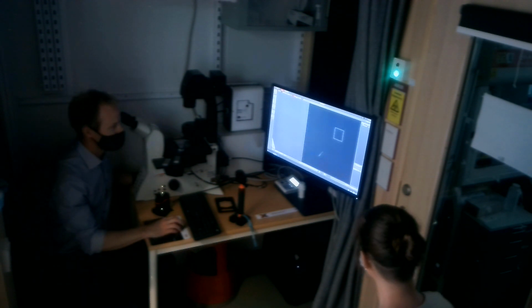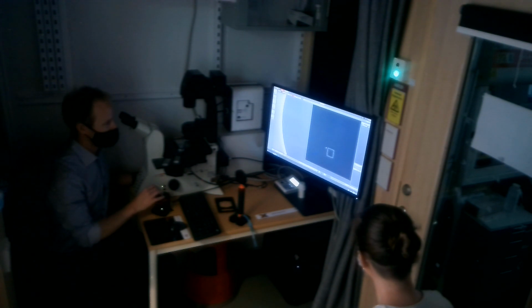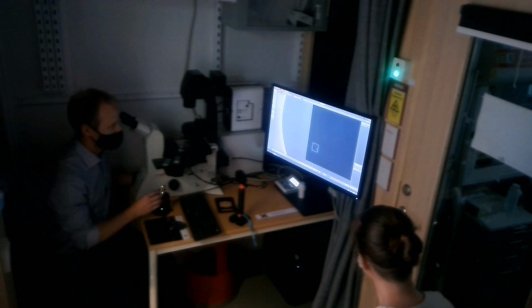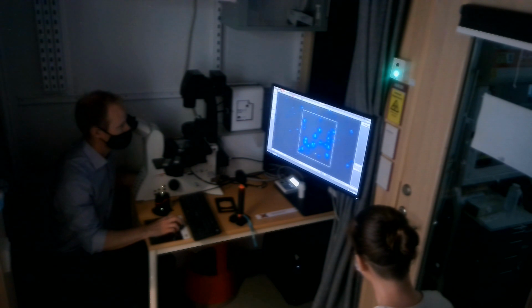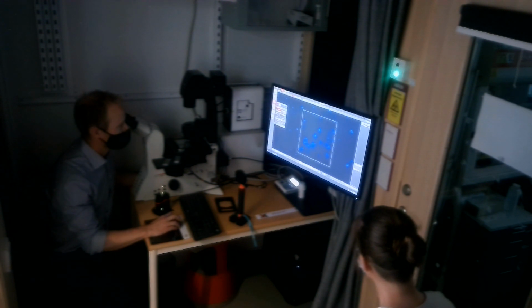But let's see. I will move into this area where there's a lot of blue. And we'll see. Go light. Very nice. Increase this. It's already. You see, this is very, very bright. Yep. These ones.